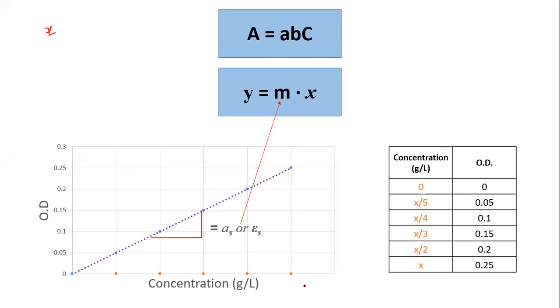Right. So you dilute the solution. Even if I give you a solution with X, you can very easily prepare dilutions of different concentrations of X, right? So I can prepare X by 2, X by 4, X by 6, and so on. Likewise, I can prepare X by 2, X by 3, X by 4, or X by 5. With the highest dilution, you will get the least absorbance. So X by 5 will be here. X by 4 will be here. Is it making sense?